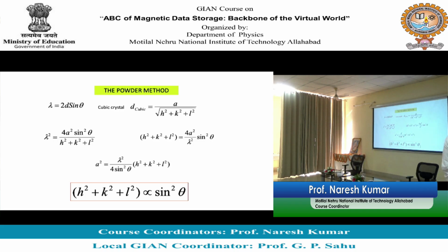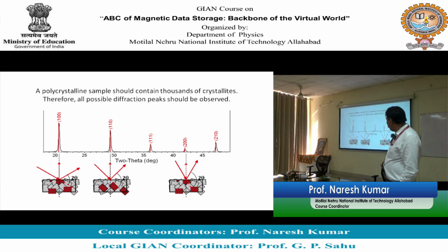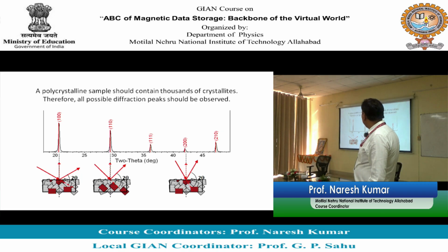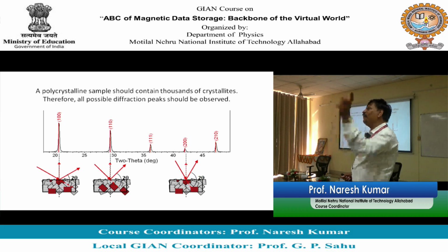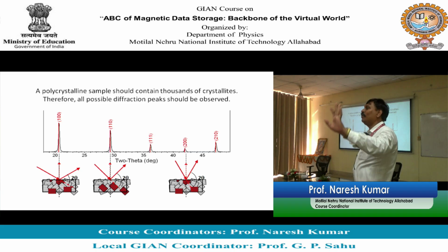Simple है. थोड़ा देखते हैं इसको. Suppose I was just telling this, suppose you have got a polycrystalline system. Let's say for this particular plane crystal, my Bragg's condition got satisfied at 2θ, you will get a peak at 2θ. If it is satisfied at this, you will get another peak, and that's how you will be getting peaks. थोड़ी सी जानकारी और दे रहा हूँ. You have got three things here. One, you are getting peaks at different theta values. So these theta values will give you d, and this d will give you a. So position of these peaks will directly give you value of lattice parameter.